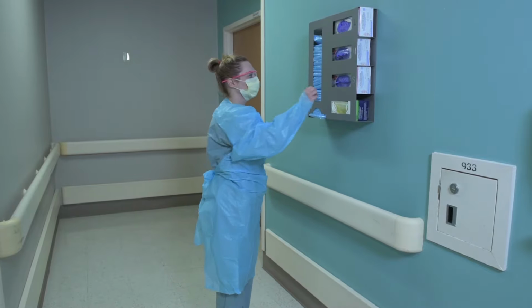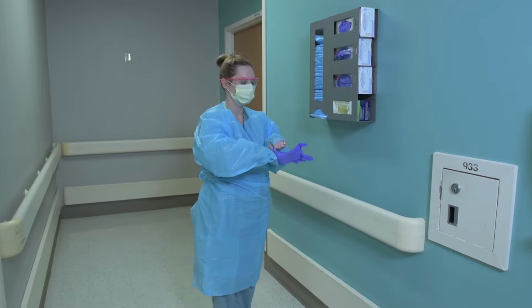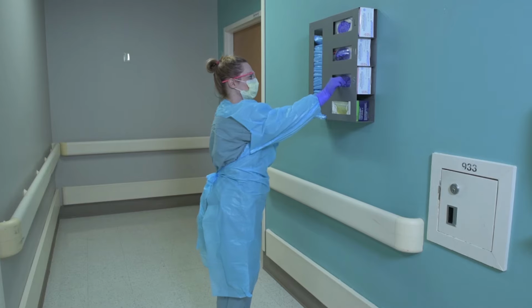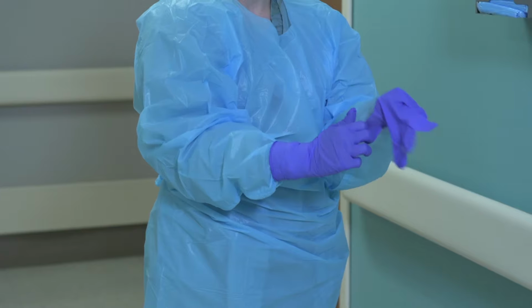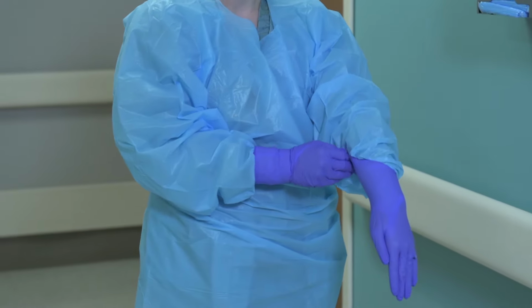Choose the appropriate size gloves to fit your hands. If any gloves accidentally fall out of the box, throw them away. When putting on clean gloves, pull the cuff up over the gown sleeves.